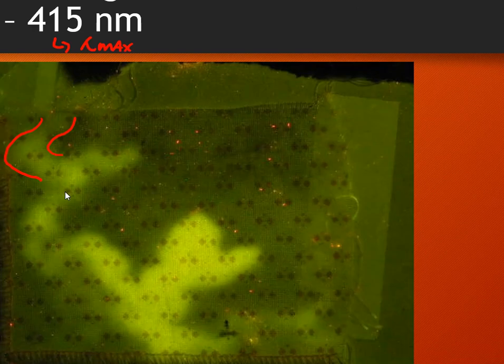But all of a sudden, we now get an extra part of the stain that was not present or that I would not have identified in the very beginning. The rest of this stuff, we could see that with different versions of the light that we have shined onto the piece of fabric. And it also looks like something else does show up kind of over in here somewhere.